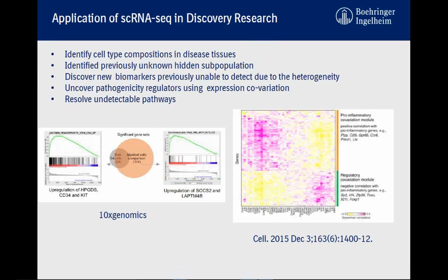And here is one published dataset, and it's about correlating inflammatory cytokine IL-17, and they really can find some key regulators. Previously, we didn't know these, and these regulators probably serve a new pathway that can become druggable. So these pathways, the authors proposed, could be druggable.